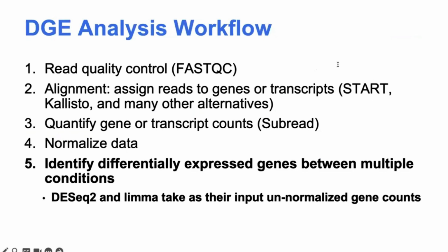To apply this DGE analysis to RNA-seq count data, before we can do the statistical analysis, we need these RNA-seq processing steps, which hopefully look familiar to you. They were covered in the earlier alignment and normalization lectures. These steps essentially transform the raw sequence reads, which are mapped into gene or transcript counts. And then we need an important normalization step to be applied to the counts.